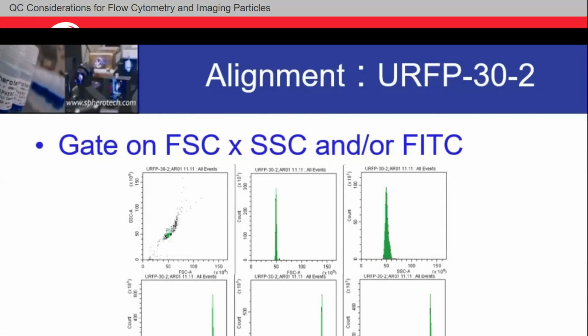If you look back into the history of things with those people that I mentioned previously, like John Martin, Mark Wilder, Leonard Herzenberg, these individuals in a lot of ways invented flow cytometry as we know it, and they were only using 1 or 2 interrogation lasers and only had 1 or 3 filters at their disposal. We now have many more, and we're very thankful for that.